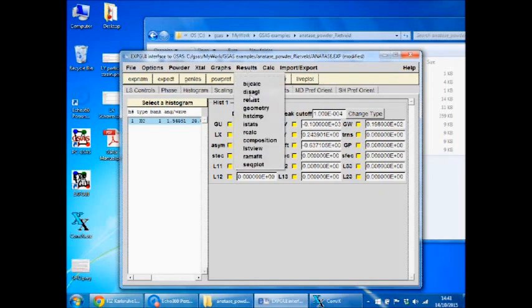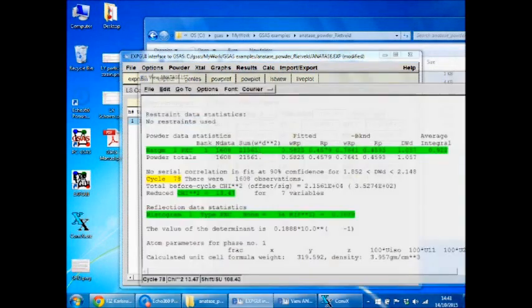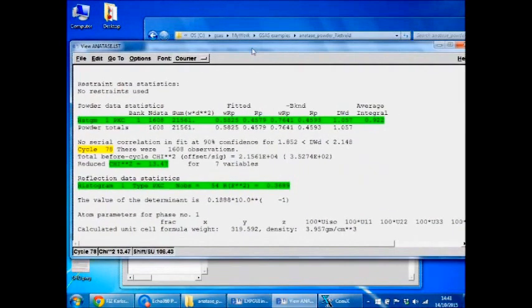So I think that example is pretty much done, but one thing that you can do is if you press results list view, it lists some really important things that we've just modelled. For instance, chi-squared, so that's the measurement of how good our fit is. But generally, what people like as crystallographers is the WRP value. And if this WRP value is low, so 0.58, I don't think is that great.